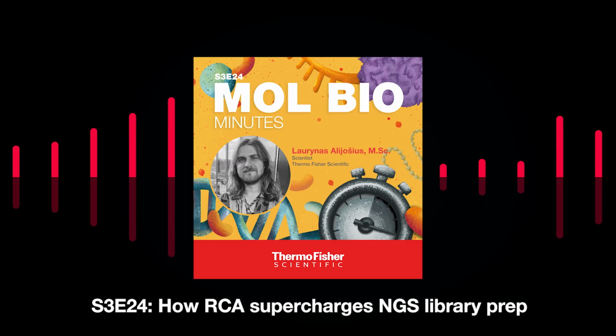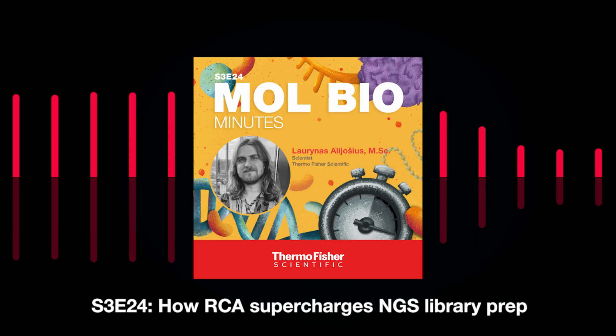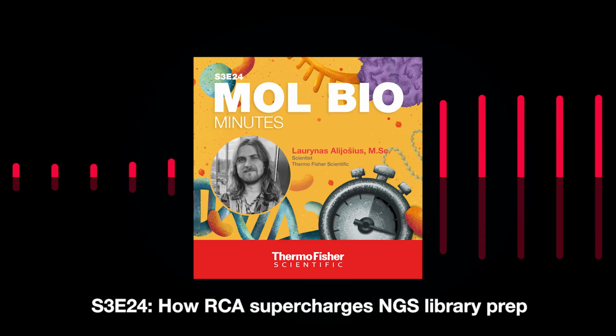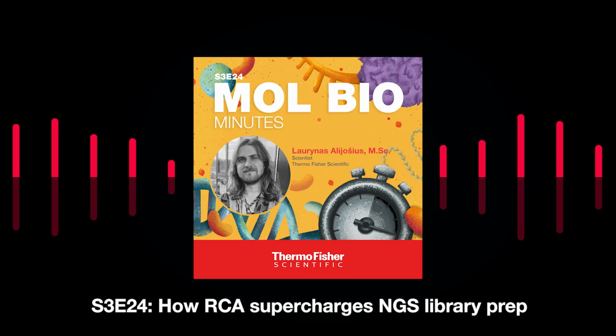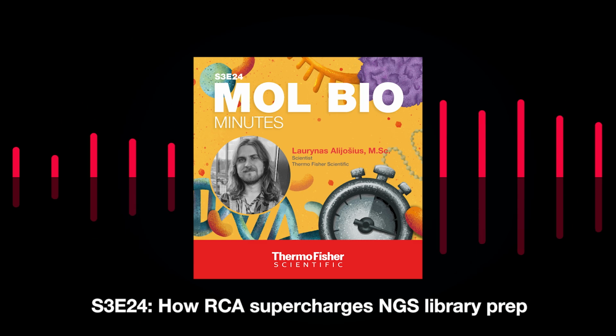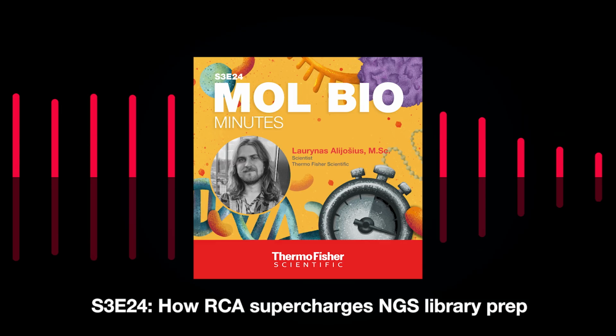For example, even RNA viruses can be tackled. First, copy DNA is synthesized by reverse transcription from viral RNA, and then it is ligated into a circular template for the RCA reaction. Then, the successful NGS can help you to find, characterize, and identify new viral genotypes.